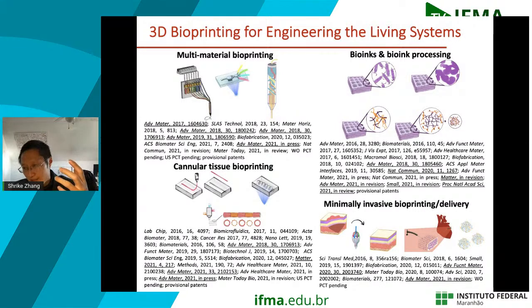And we have also been working on bioink developments. As mentioned, bioinks are probably one of the most important components of bioprinting. They not only have to ensure that the printing happens in the first place, but after printing, they also have to ensure that cells are growing and functioning there, in order to have the final mature tissue built. So that has also become very important. And we have been developing minimally invasive bioprinting methods as well. Basically, a combination of the conventional bioprinting methods with more modern surgical equipment, made in a way that you can hold them in hand so that you can print directly on the wounds in situ without having to print an implant, right?